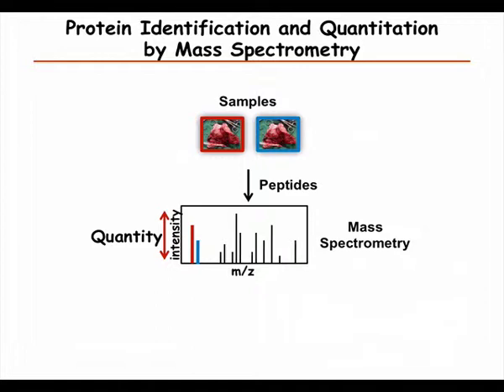And the reason for that is that the strength of the signal is very much dependent on the peptide sequence. So if you mix together two different peptides with different sequence, equal amount, depending on what solvents you use, how you do the separation, you can get one peak being 10 times the size of the other, or the other being 10 times the size of the other.